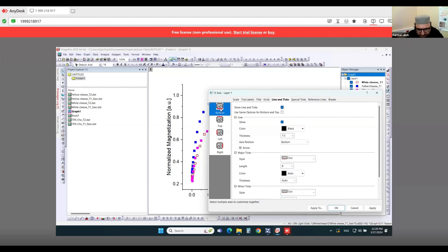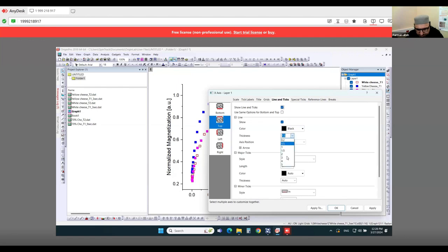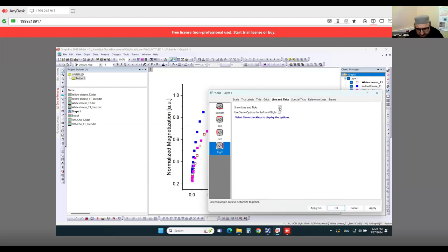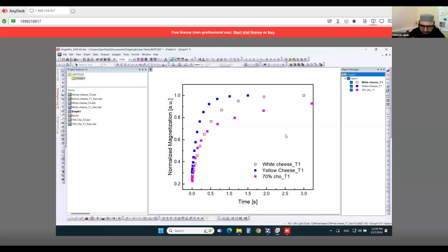So there's some practice with Origin, so you can do. I do not want this, so right. So now it seems better.